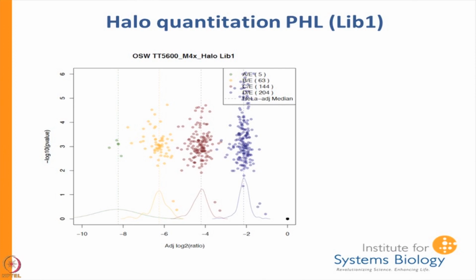So this E sample has the most things in it. And so pretty much anything in D is also going to be in E, and anything in C is also going to be in E. So this is most concentrated, less concentrated down here. So by the time we get to the very low femtomole sample, we only see 4 or 5. So actually, the number that we see is here. So out of these 475 peptides we spiked in, we're only seeing 204.